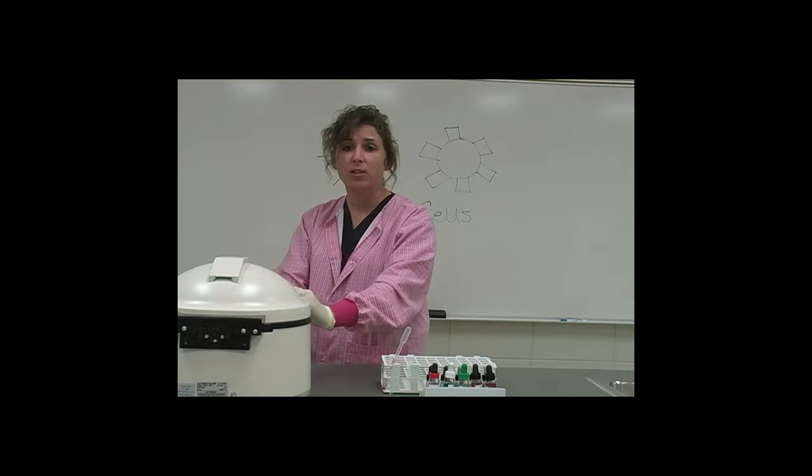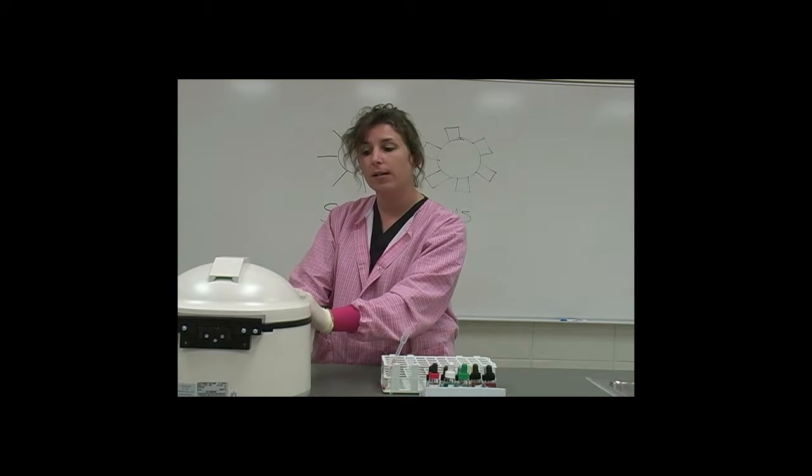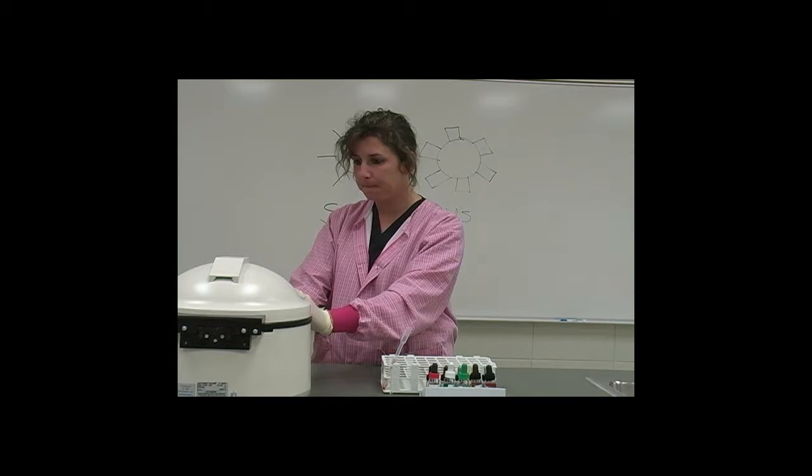As a safety feature, the lid will not open until the rotor has completely stopped, and this takes just a few more seconds.